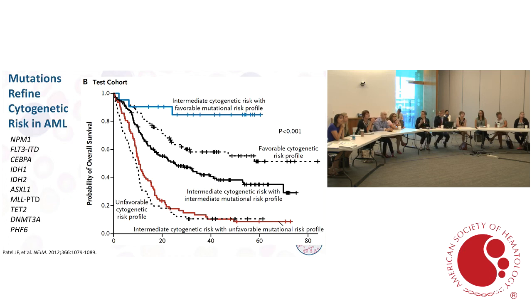So this is a complex karyotype because you have more than 3 abnormalities present. It's also a subclassification of that complex karyotype called a monosomal karyotype. And we've written the definition of the monosomal karyotype on the left.